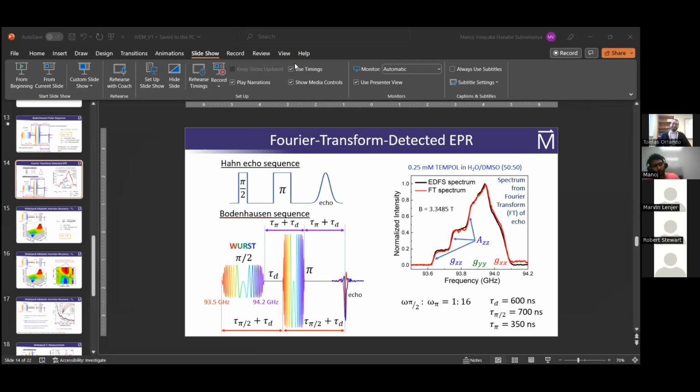In principle, you could. I can think of using chirp detected NMR to find the hyperfine couplings. But otherwise, the spectral bandwidth is large compared to the excitation bandwidth, so I'm not sure we would obtain much out of doing the Fourier transform EPR.